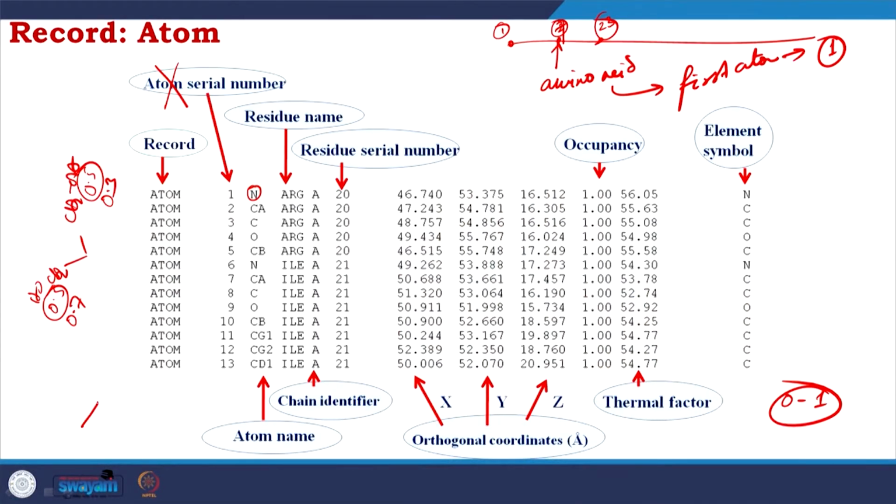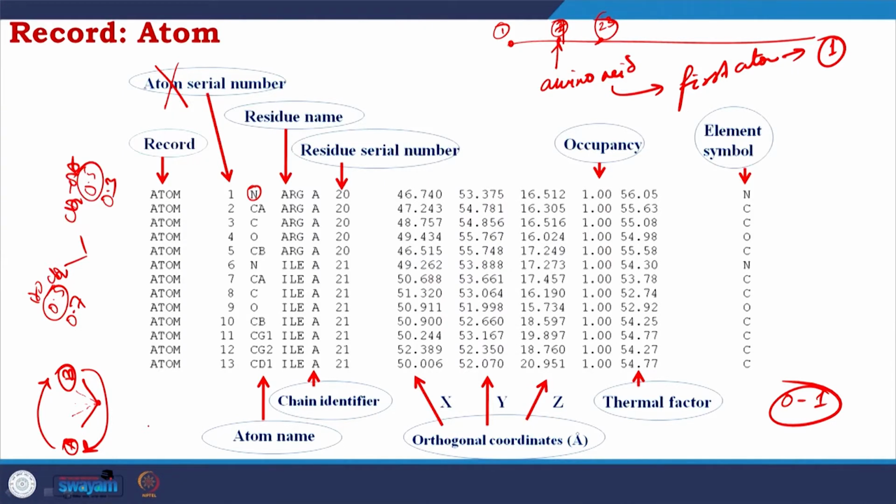What I mean is, if your protein's amino acid has conformation A here and conformation B here, it should go from A to B or come from B to A. So, you should have some intermediate conformations also, and that is perfectly true. So, why is it not there?